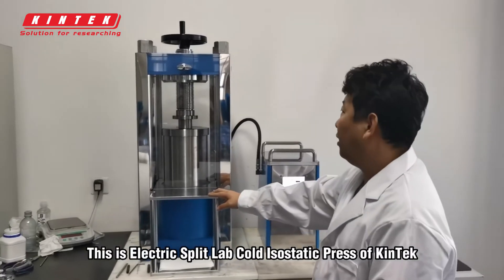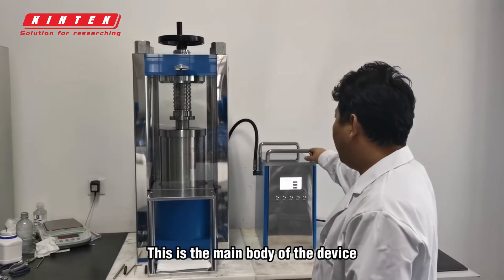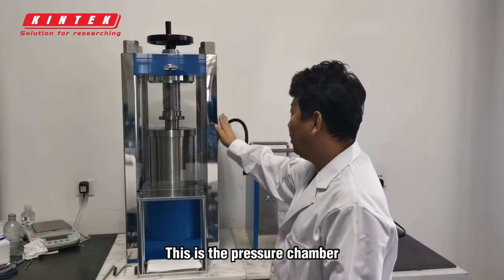This is the Electric Split Lab Cold Isostatic Press of KinTek. This is the main body of the device. This is the pressure chamber.